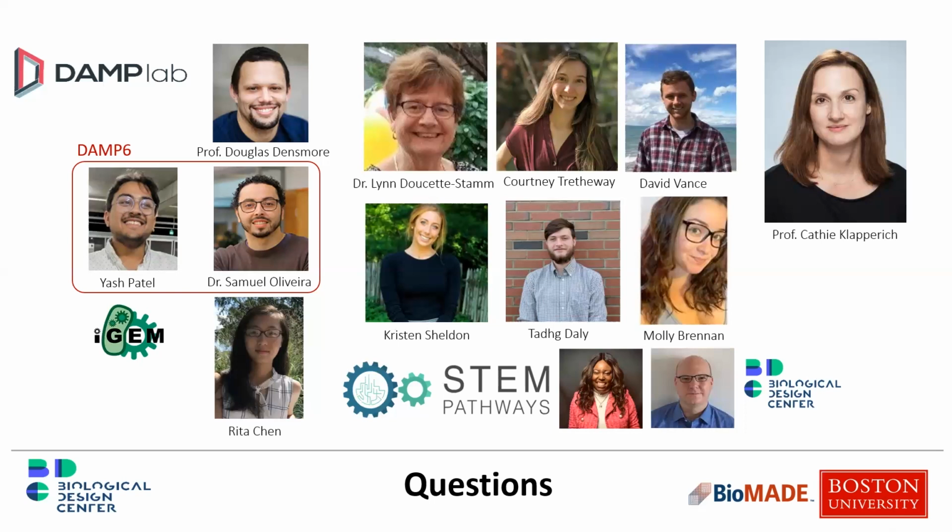Yeah, I'll just add, really quick, you might be confused. Everything was going well, and this became a very end-of-the-day talk. Why are we talking about microfluidics? If you remember the way I said the DAMP lab started, I said I made software. People said this was cool, but I had no lab to do anything with what came out. Similarly, the same software that my lab makes that makes DNA also makes a graph of how the DNA should interact in a microfluidic. So now I need to connect to a plate to make microfluidics. So I need to do 2 connections. We were already offering this microfluidic fabrication process for our group. So I said to Samuel, why don't you make it available to anyone that's using the DAMP lab anyways? They're already coming to us. That's the genesis of it.